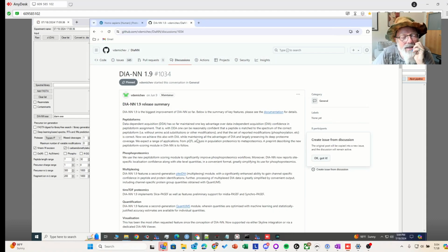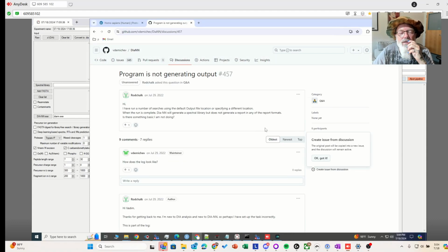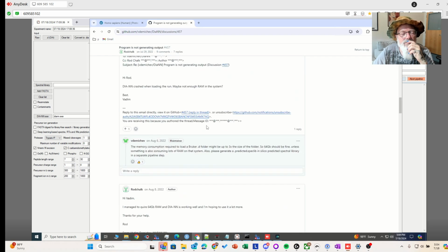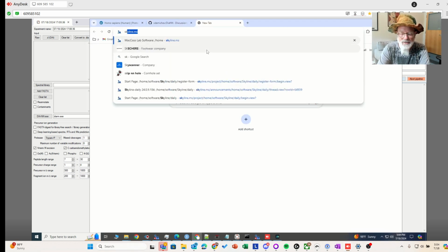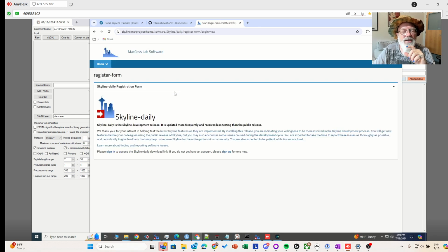It's a long day. There's a thing you have to do when you download Skyline Daily. I don't think this has been fixed yet, but it will be fixed eventually. You need to download a specific version of Skyline Daily in order for DIA-NN to see it.